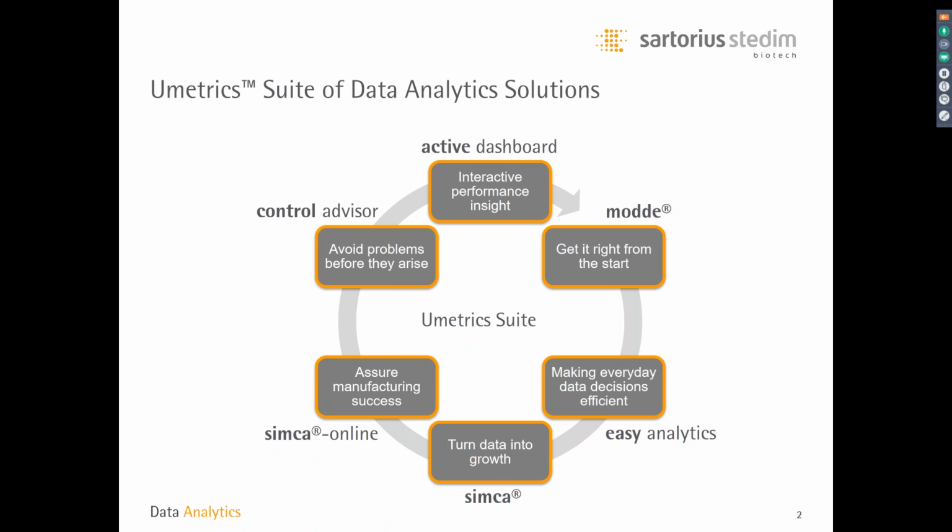And from there, if we build nice models in SIMCA, we can move to get these to run in our manufacturing environments in real time with SIMCA-online. And if we have the right type of models, perhaps we can have SIMCA-online and these models direct us in how we should run the process with Control Advisor. And this is what I'll really be focused on today, the Control Advisor aspects.